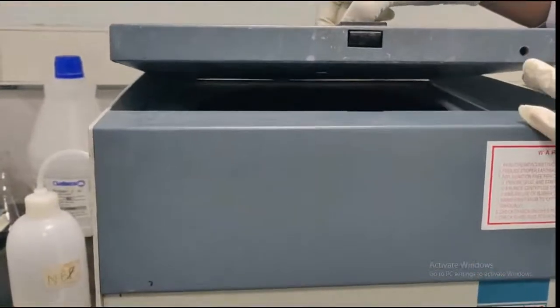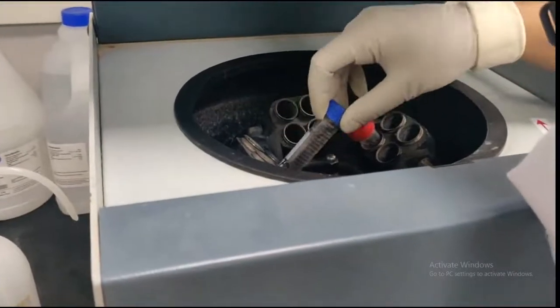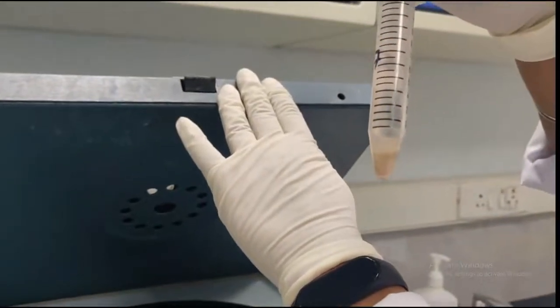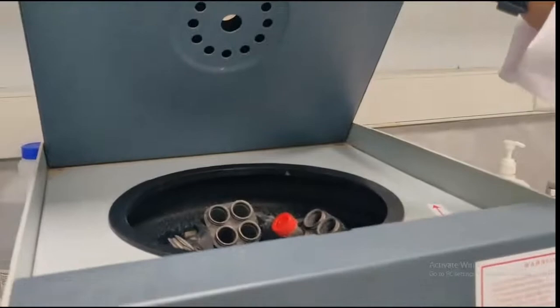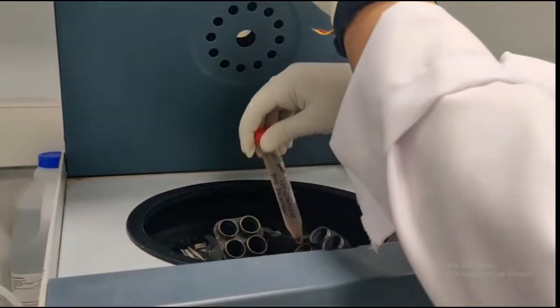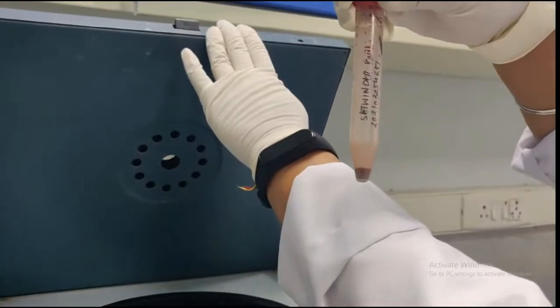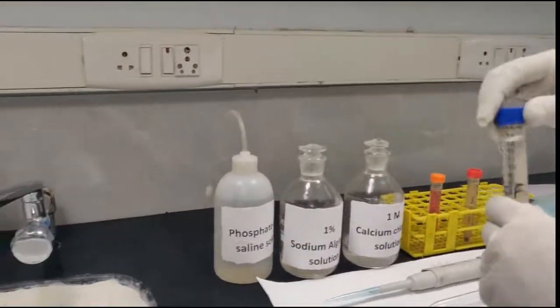Now this centrifugation is over. We are now taking out the tubes. So a more clearer pellet. The supernatant is also clear enough. Same for this aspirate sample also. So now, before the next step, the supernatant will be discarded.